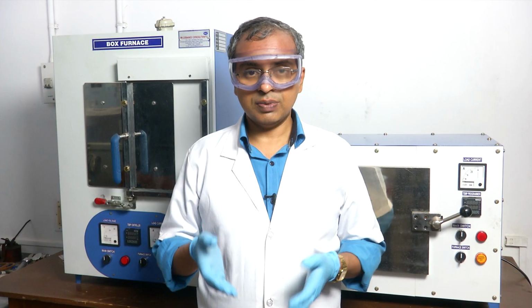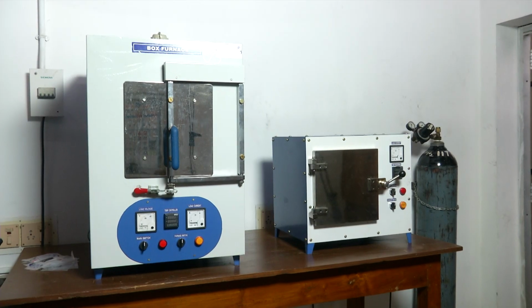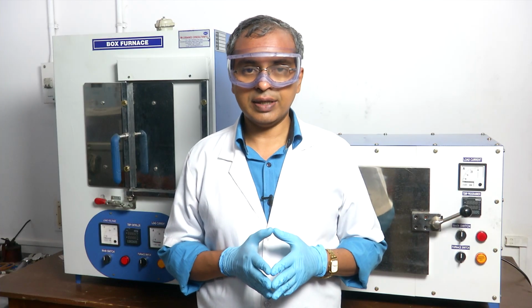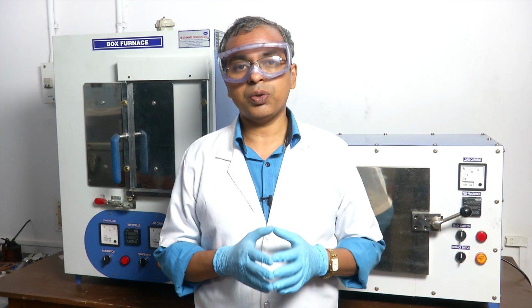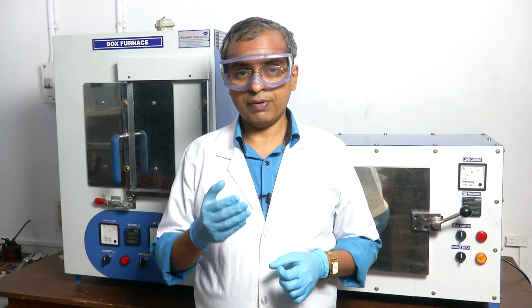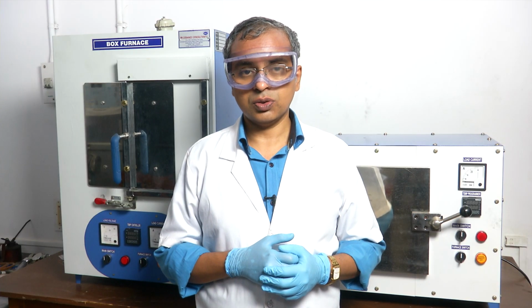There are also furnaces which are vertical, there are furnaces which are horizontal, there are box type furnaces, there are tube type furnaces. So, a lot of variety in the type of furnaces that you have there, but principally they bring into your workplace a source of heat which could be controlled, which could be running at a very high temperature, and therefore, you need to be careful when you handle that source of heat.